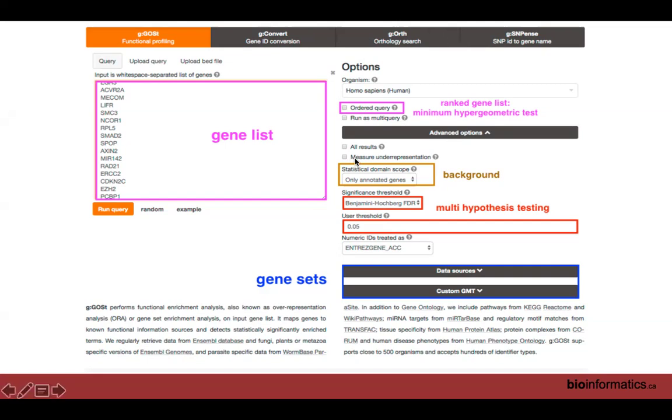That's why we tend to recommend that you specify all results, so that when we get to the later stages, we can pull out the pathways that are not coming up as significant, just to make sure that they align with what we're looking at. Often we can have data sets that are pretty noisy, and it's a mechanism by which you can investigate your results and maybe try and uncover what the issues potentially could be.